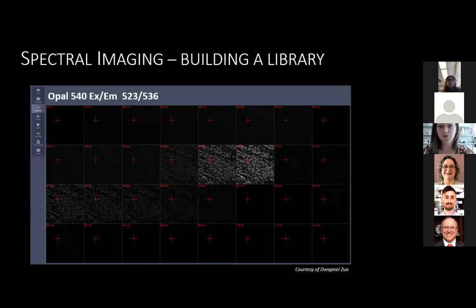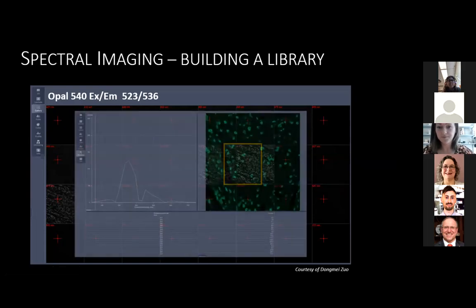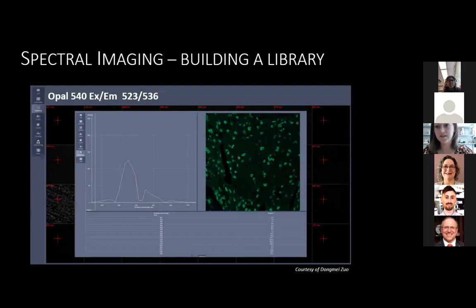then you're able to image that particular sample in increments of 10 nanometers. So we start at 421 nanometers, increase by 10, all the way through the entire visible light spectrum. We can actually select which wavelength is going to be specific to that dye. And we can do that for all 7 dyes, and that way we know that each one is going to be unique and specific to that fluorophore.